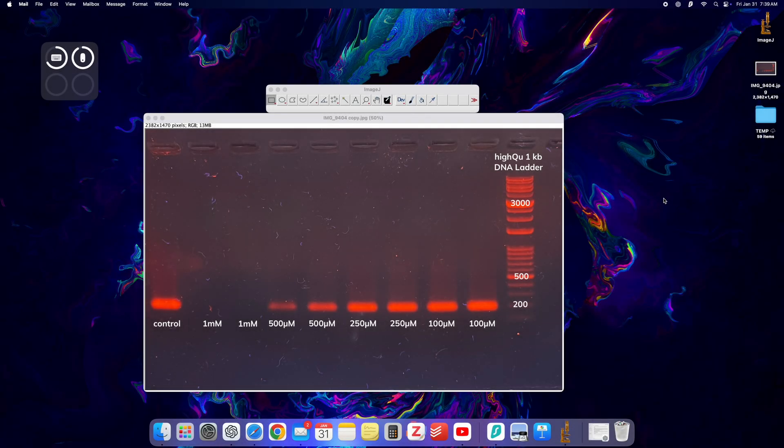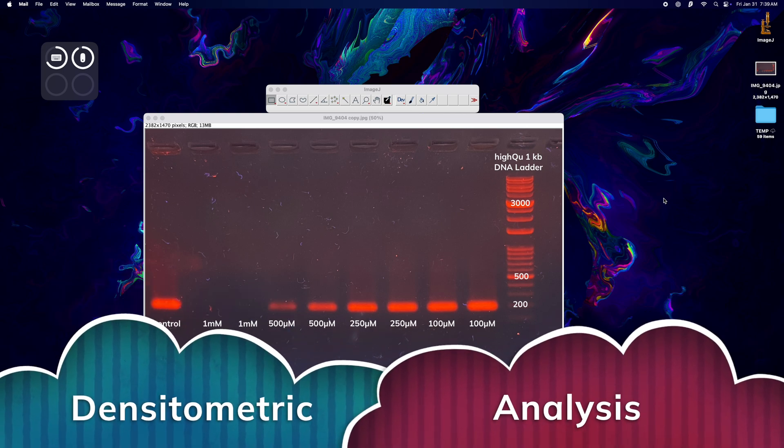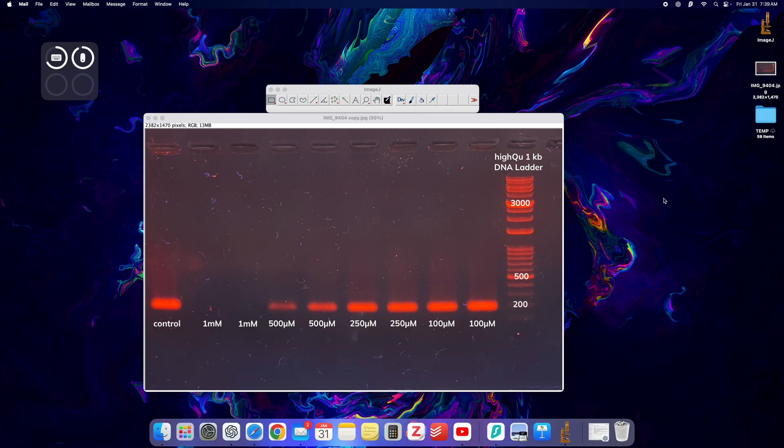Hello and welcome back to the channel. In this video I want to show you how you can perform a densitometric analysis on a DNA electrophoresis gel using ImageJ.